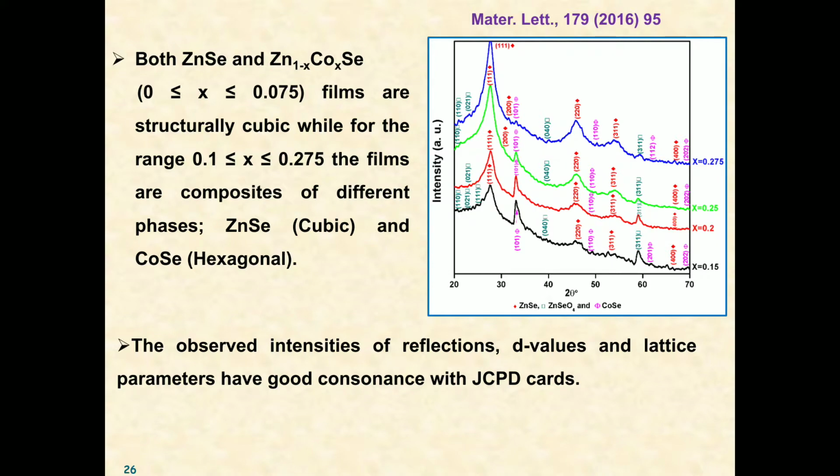The observed intensities of reflections, d values, and the lattice parameters are in good agreement with the JCPDS cards.